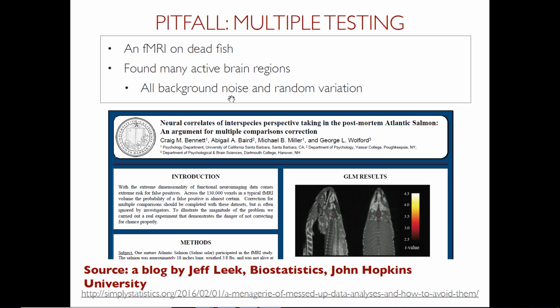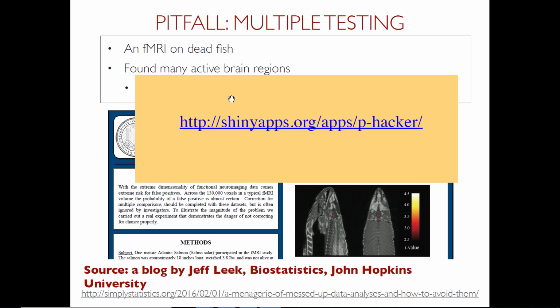And if we have even a small probability of finding false positives, if we have many regions, we will find them. So this is very much the problem in proteomics, especially when we are going for bigger protein lists, trying to have bigger coverage, more fractionation, or whatnot. So this problem becomes really exacerbated. Oh, and this is another one. This is where you can also look at another app where you can do the hacking of p-values like that.